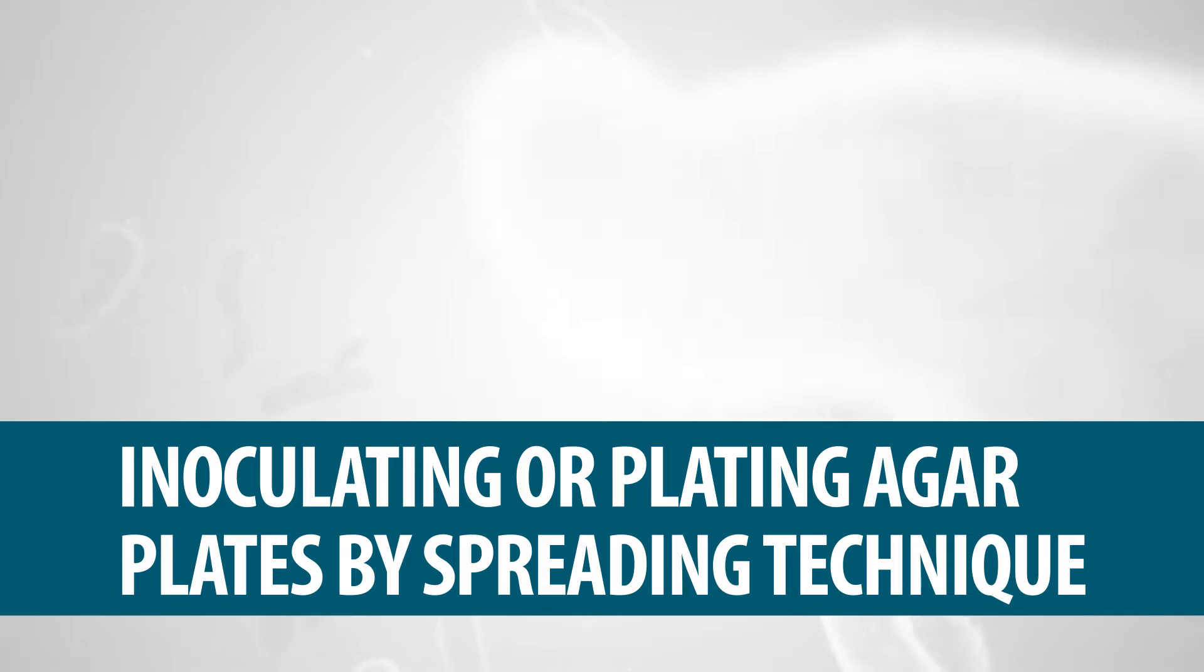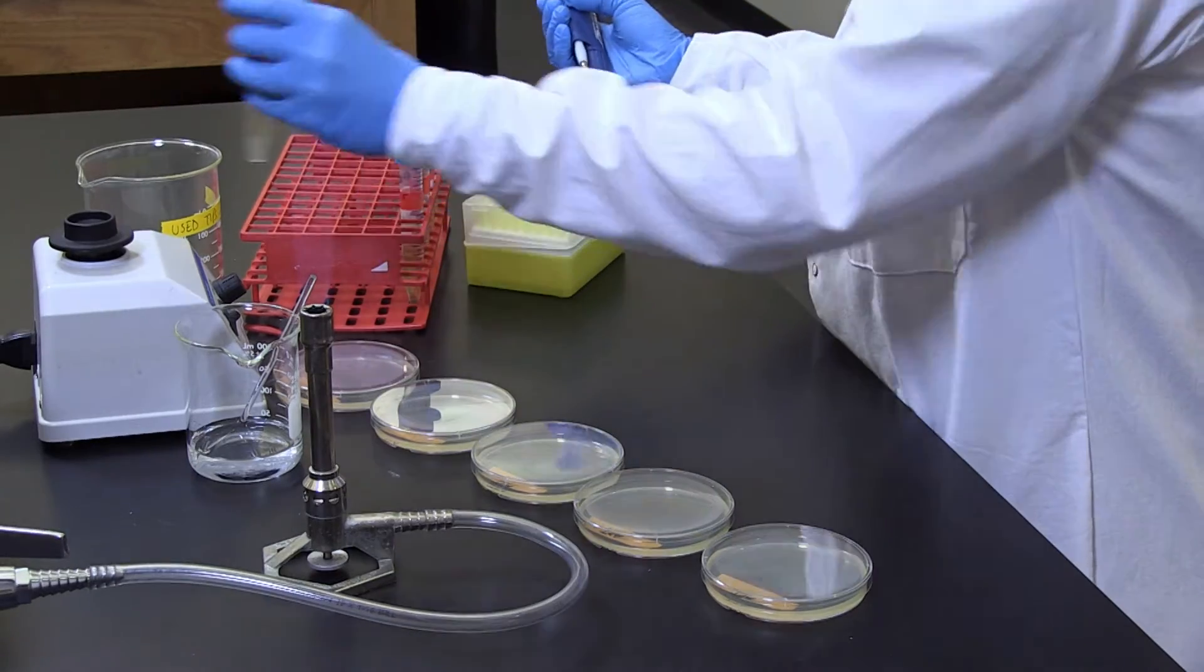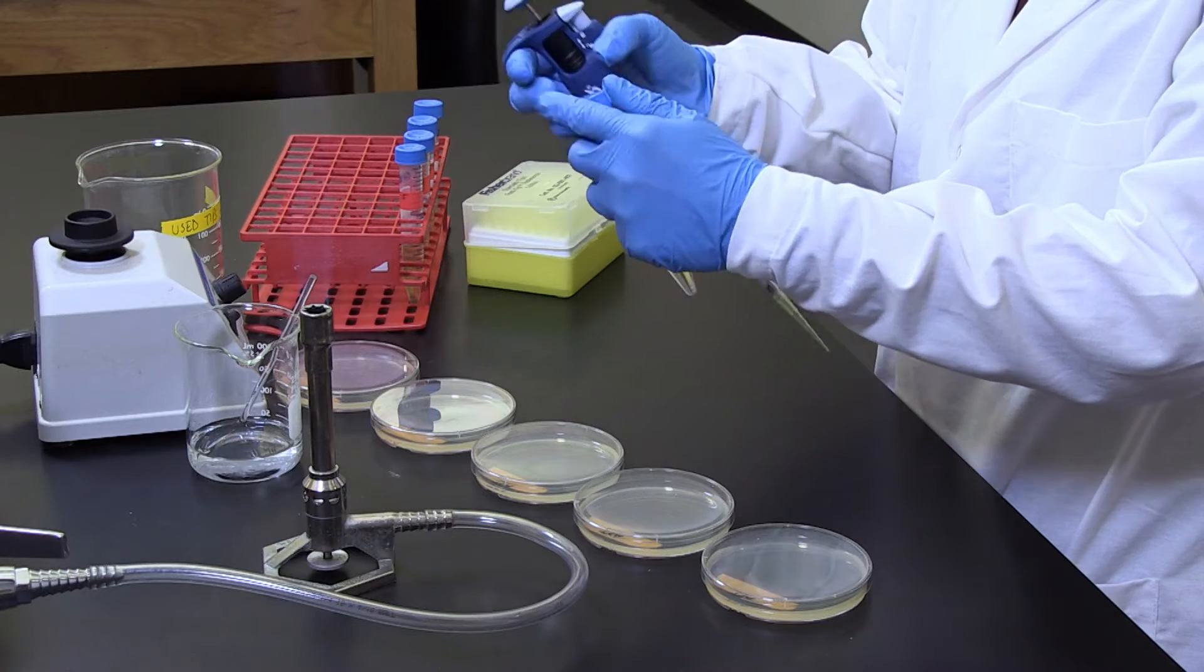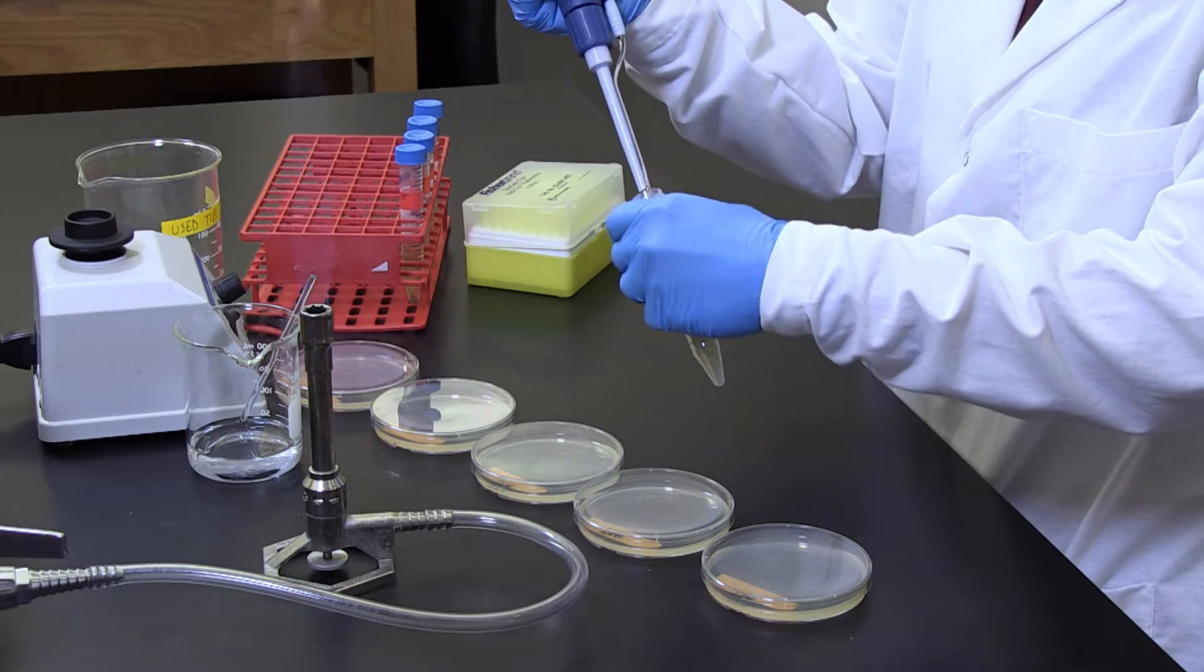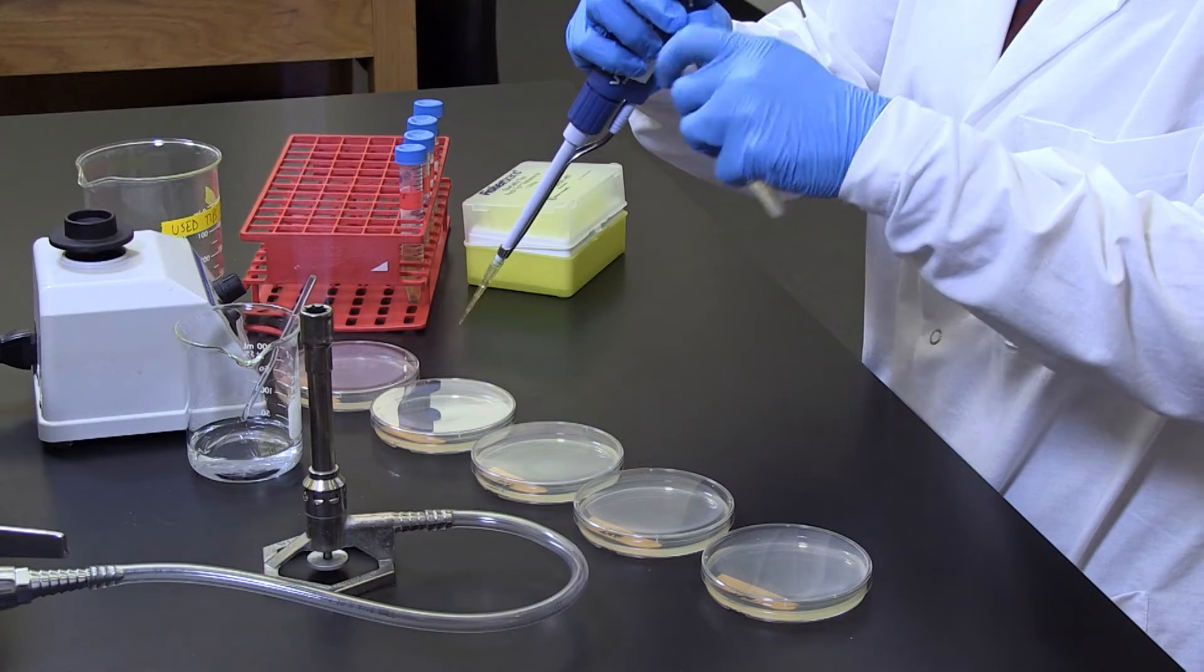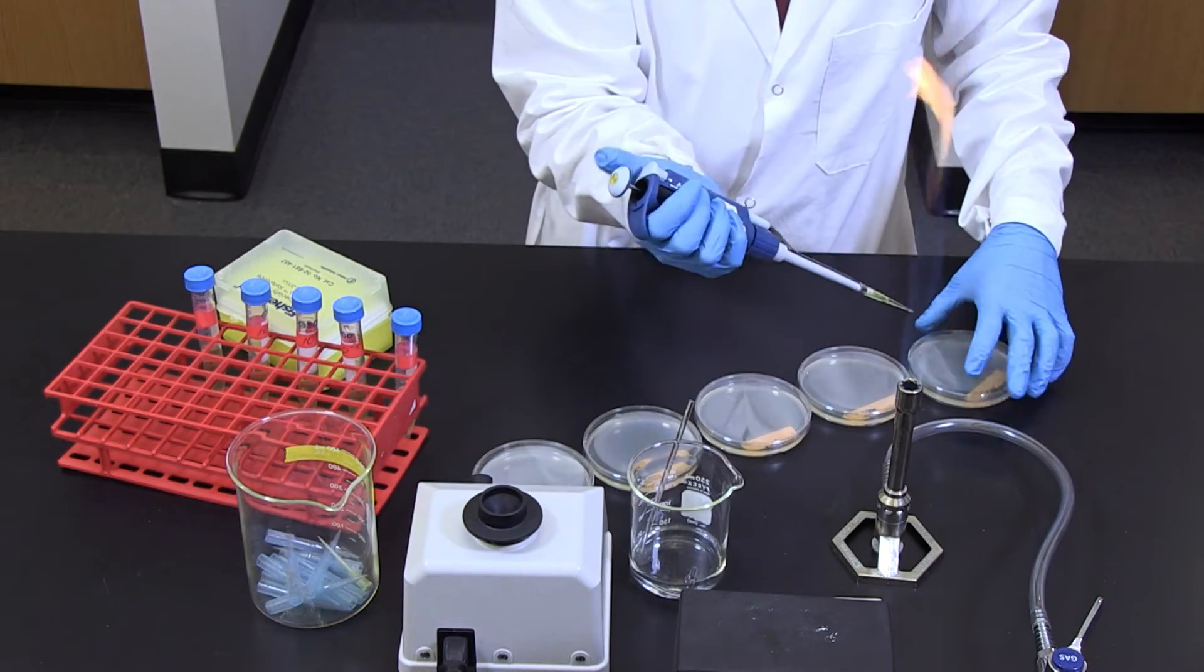Inoculating or plating the agar plates by spreading technique. The next step is to plate or inoculate the agar plates with the dilutions just produced. Apply aseptic technique and start with the diluted sample in the test tube labeled ten negative four. Transfer 0.1 milliliter or 100 microliters of this solution into the agar plate labeled ten negative five.